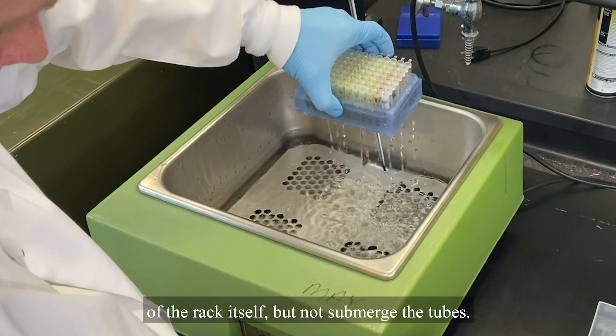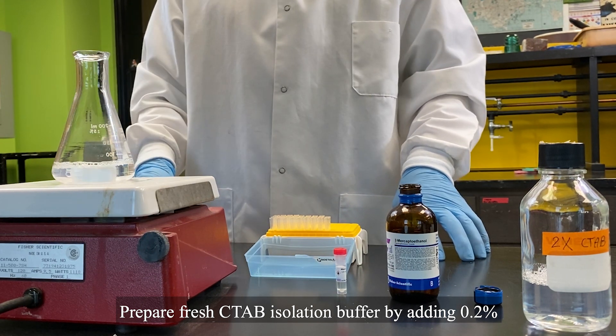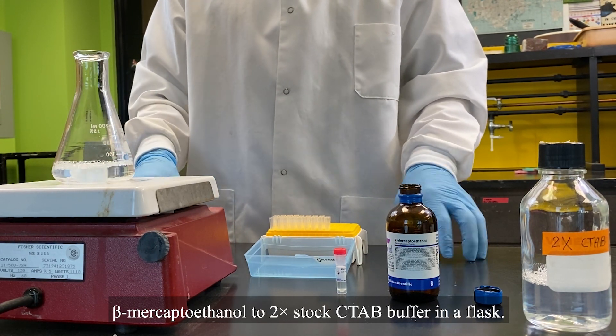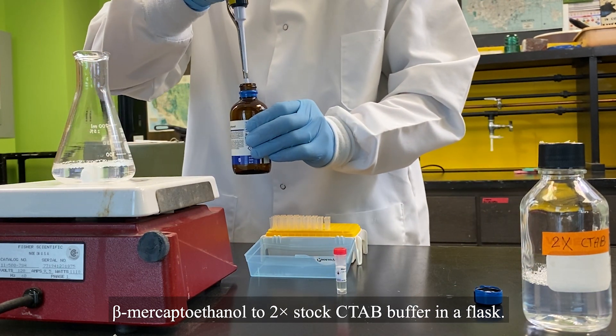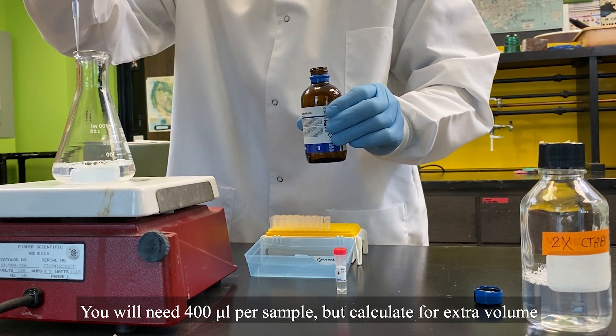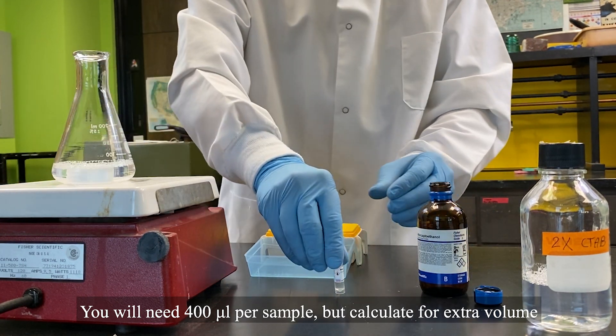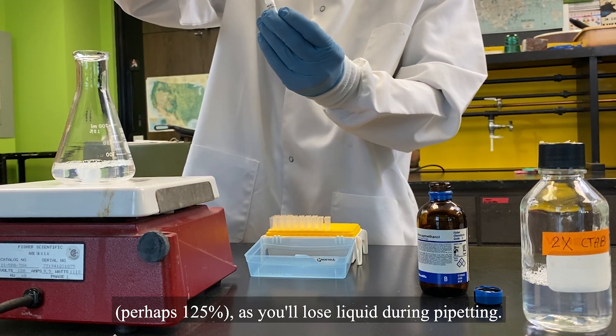Prepare fresh CTAB isolation buffer by adding 0.2% beta-mercaptoethanol to 2X stock CTAB buffer in a flask. You will need 400 microliters per sample, but calculate for extra volume, perhaps 125%, as you'll lose liquid during pipetting.